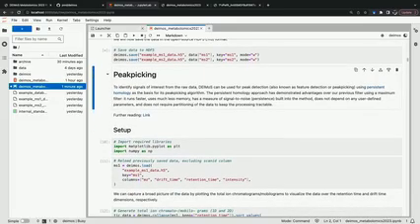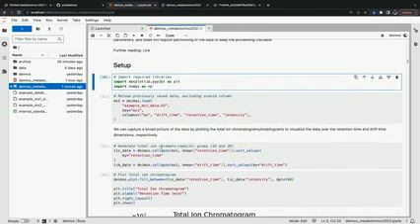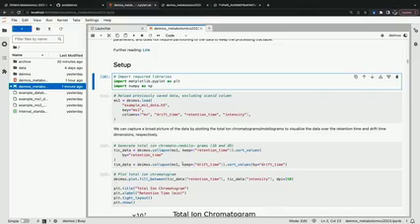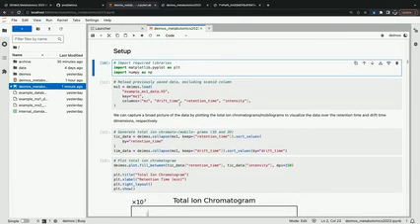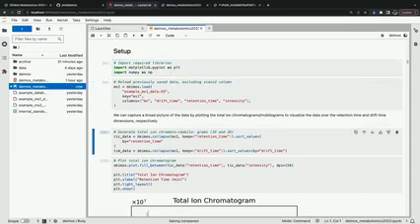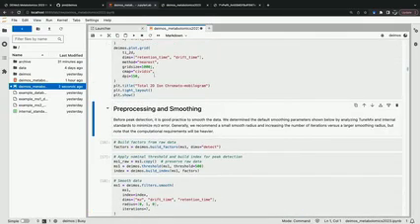So I guess we can cover the peak picking in the notebook. Should I just run? I'll just run a bunch of these, and then we'll go through the notebook. Okay, we'll just run a few of the cells and then go through the notebook and the HTML just for time reasons, but I'll just run a few of these. Okay, up to pre-processing.